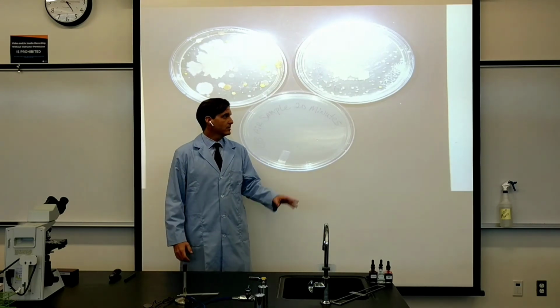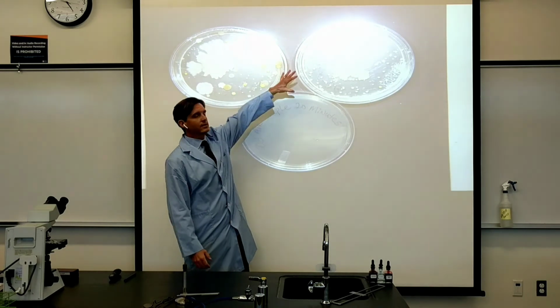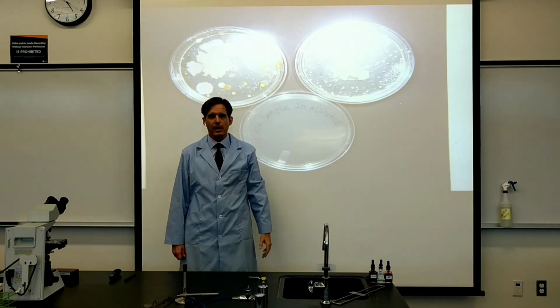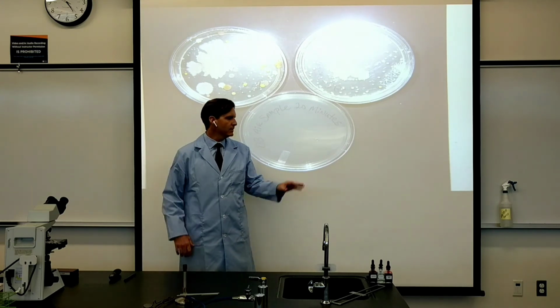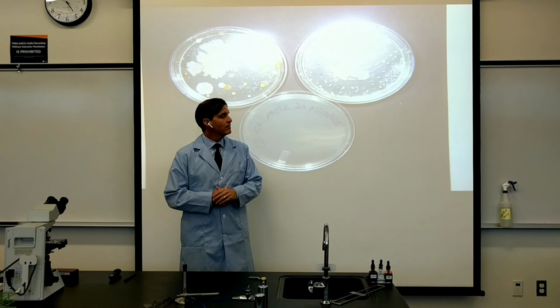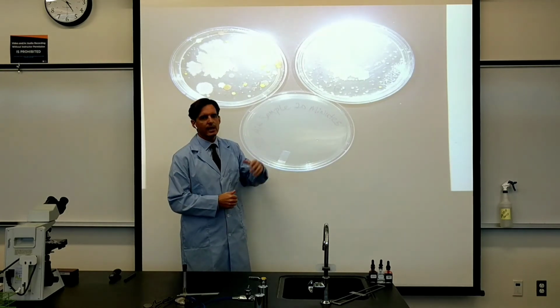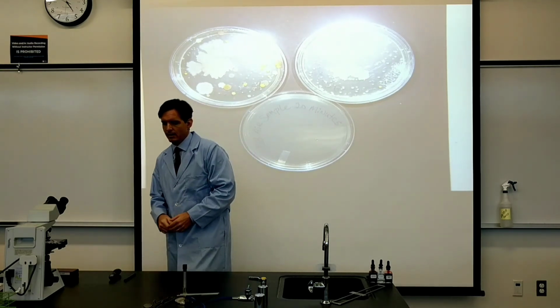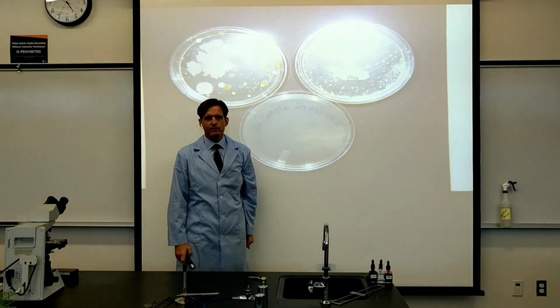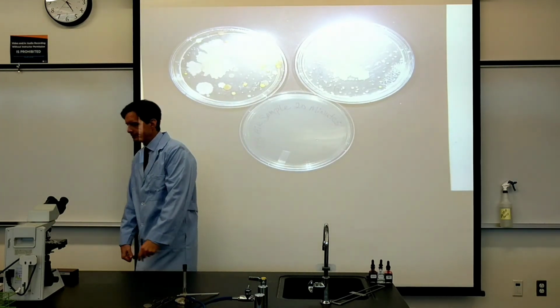But the air can sometimes, if you leave an air sample out for long enough, have a good number of the colonies that popped up from these soil samples, especially if you leave a plate outdoors. So we didn't have that to look at this semester, but at least we got a chance to see how this technique is performed. And we're going to be doing a study of fungi in the future, so we'll get a chance to see fungi.